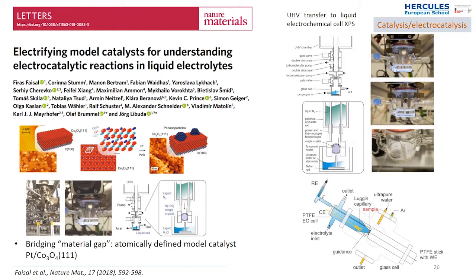So to bridge this materials gap, this group prepared, on a single crystal, which is a model system, small islands of platinum, mimicking a little bit more of a real system, bridging those two different worlds: the real one that can be used in electrochemistry, and the model one that is suitable for ultra high vacuum.